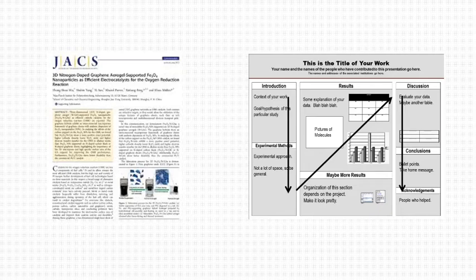In the case of your NMR spectrum, you don't really have to have a figure for that one at all, but for your IR spectrum, you'll want to embed those figures in the document, not just append them to the end. And you will want to use ChemDraw to make any structures that you want to use in order to represent what's going on.